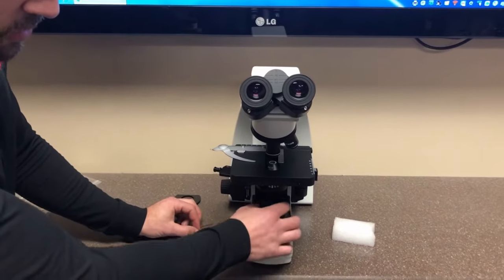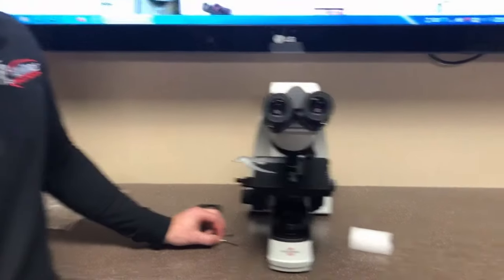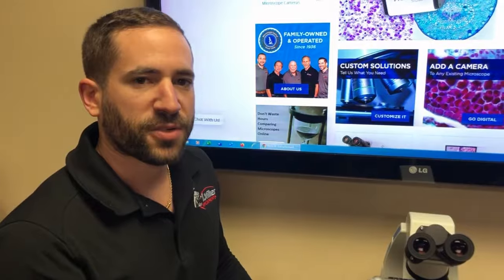An optional green filter can be placed over the lamp house of the microscope, and that's how you use the AccuScope 3000 LED SPH microscope.